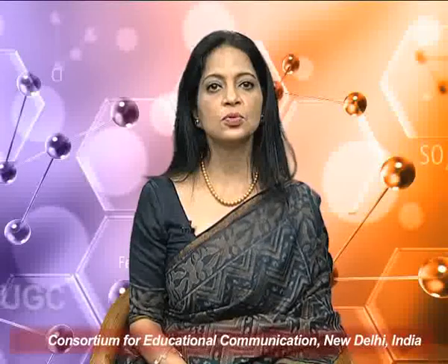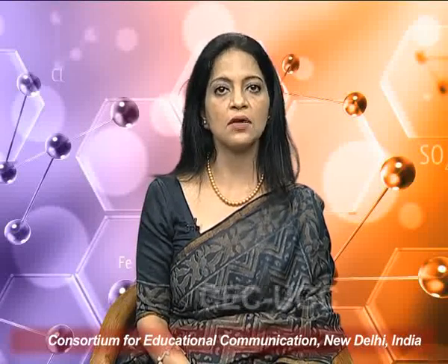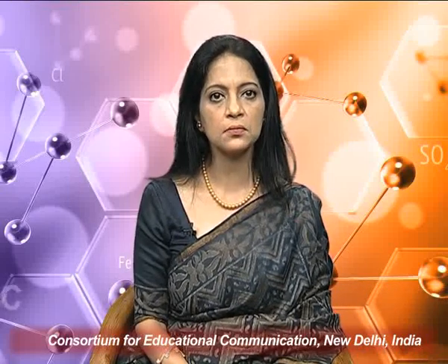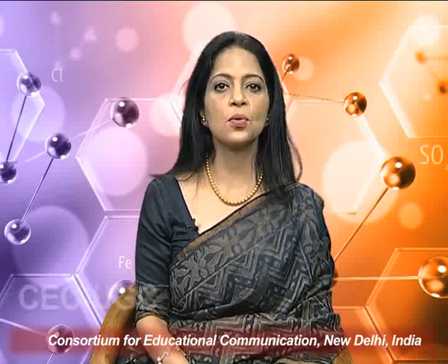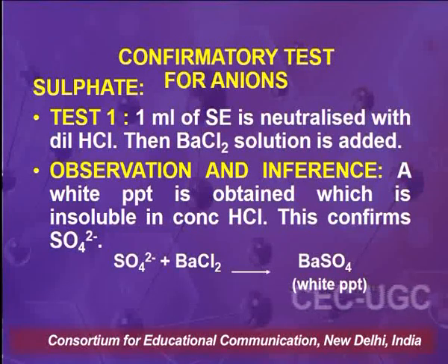The next step which we move on to is the detection of sulfate ions, or rather confirmation of sulfate ions after its detection in the mixture. For this, 1 ml of the soda extract is neutralized with dilute HCl, and then around 1 ml of the barium chloride solution is added to it.